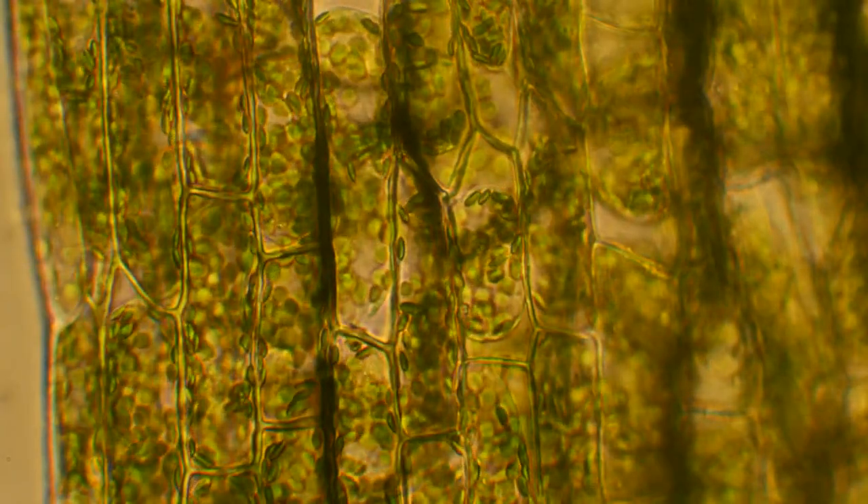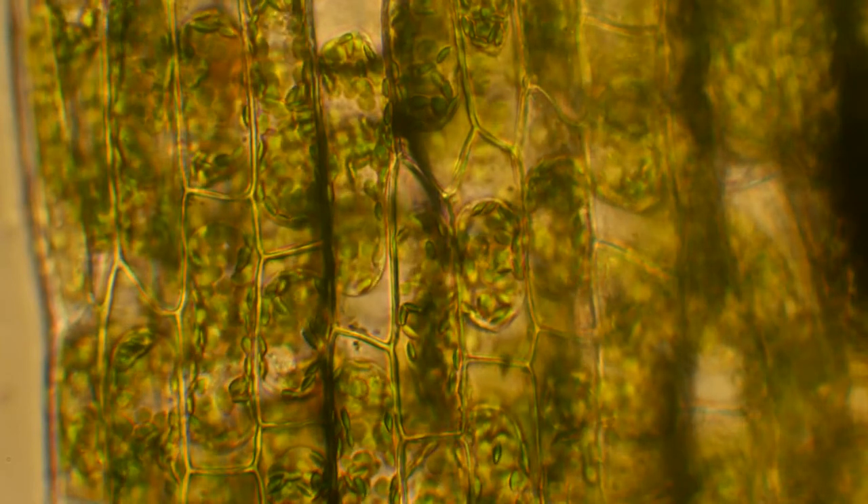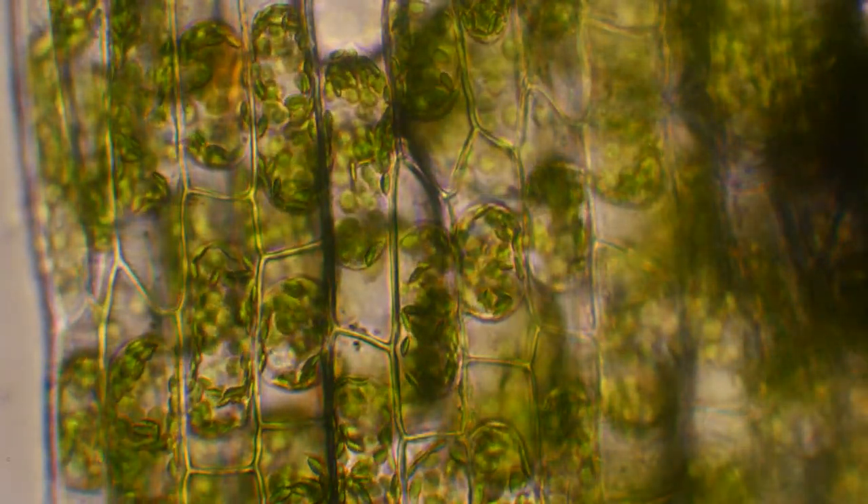Check it out — they are shriveling up. They're shrinking down into tight little spheres. This might look interesting, but it's bad news for those cells. It happens in just a minute or two, but we're seeing it sped up even more.